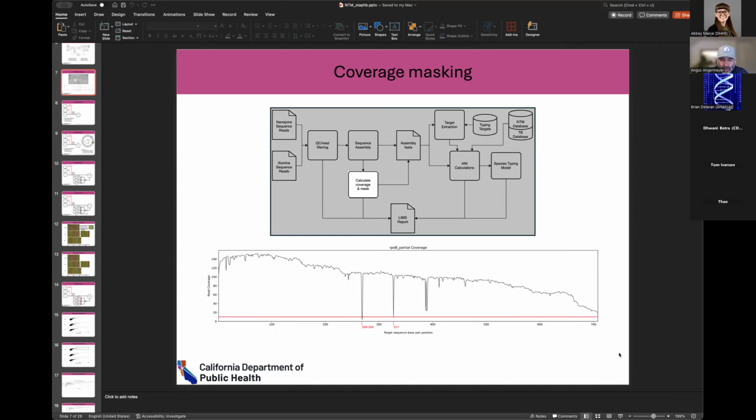I know there's a lot of people on this call, so others might have some thoughts about it. I think 10x is designed more for a broader drop-off, like we couldn't even get any sequence across certain regions, not for these onesies, twosies. So I was curious what step was filtering out a lot of data just because there was a drop-off of 2 bases or a single base pair or a very short stretch, which can be a real deletion, actually.